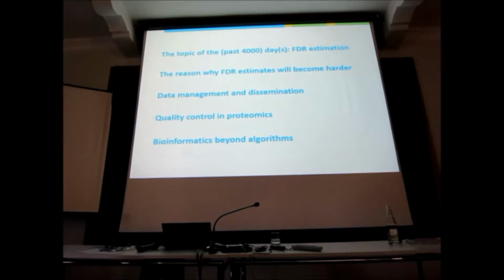data. So this has been a very hot topic, not the topic of the day, although it's definitely very much in vogue again today, but the past 4,000 days. So let's say give or take 10 years and a bit, right? This came up when proteomics became high throughput. Then we started realizing we have to control for this. The problem is, how do you know that these FDR estimations that everybody uses work? So we'll talk about that, about a way to figure out whether they work, and I'll show you where they don't work.